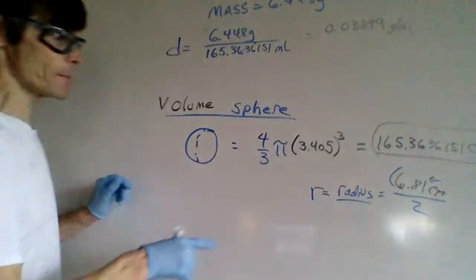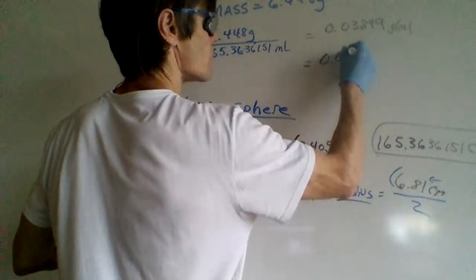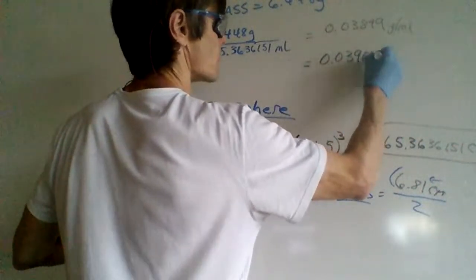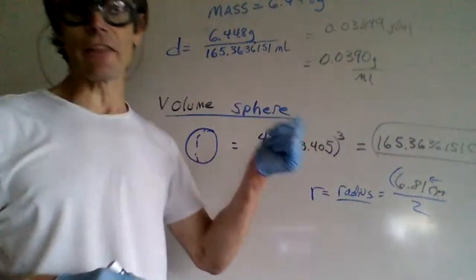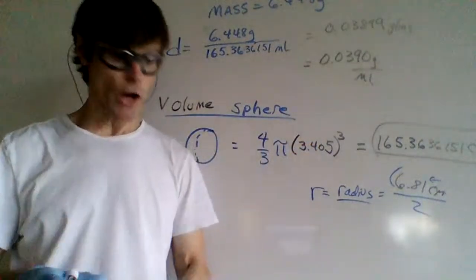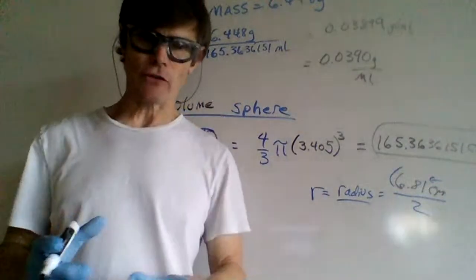And if I was going to limit myself to 3 significant figures, the data that I looked up said it's about 0.045. Not too bad. Not too bad.